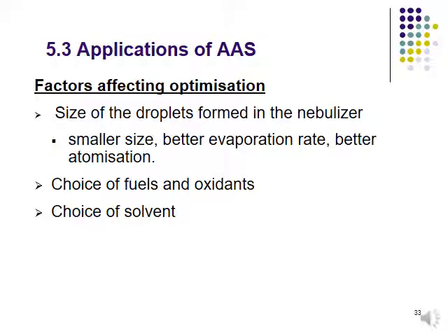Second is the choice of fuel and oxidants. If you want to detect iron, you must consider what kinds of fuels and oxidants are appropriate for your analysis.